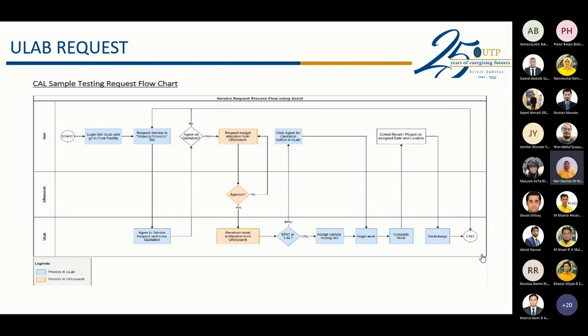With COD, everyone can dump patterns into the database, so you need to really carefully select which one you use to compare and choose as your compound.